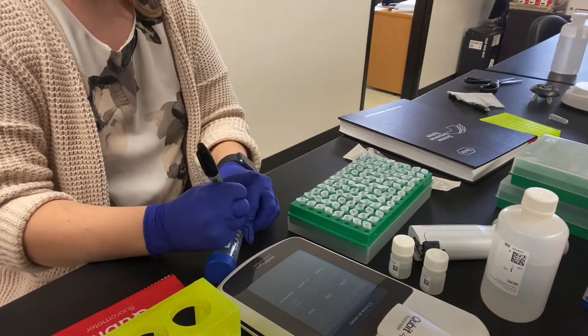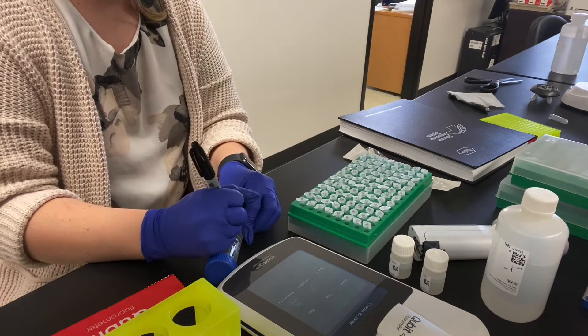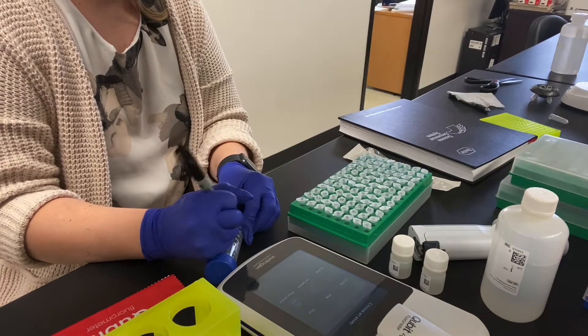This mixture is pretty stable for up to 24 hours. If you're making it ahead of time, plan on keeping it wrapped in foil and in the fridge — the reagent is light sensitive.